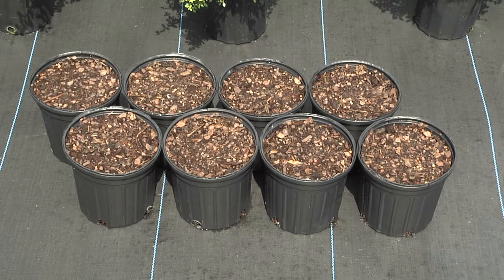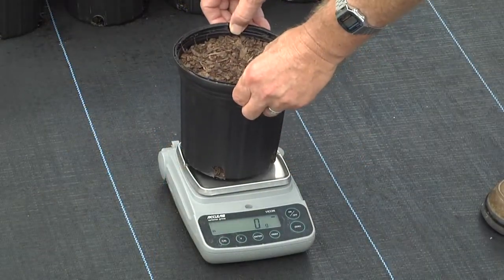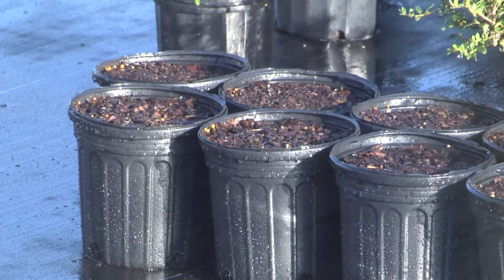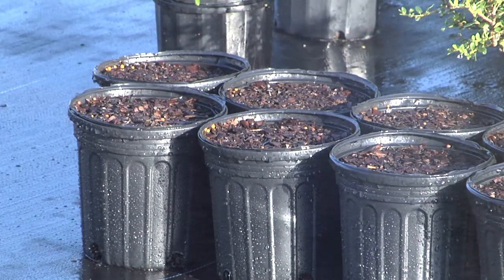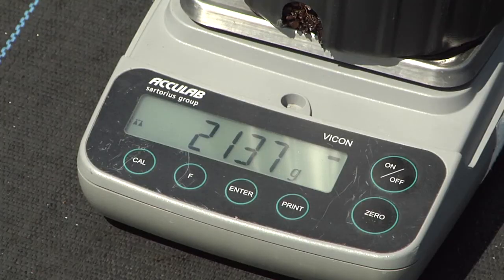Next, fill 3-5 of the same containers with the air-dried substrate to the same fill depth used in determining the substrate volume. Weigh each container and average the weights. Irrigate the containers thoroughly for several days to ensure the substrate is at maximum water holding capacity. Weigh each container after drainage and average the weights.